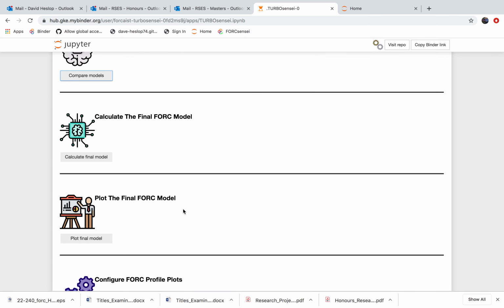There's an interactive interface where you can add a color scale, you can change the range of the plot, you can specify things like contours, how often you want contours, what thickness you want contours, and so on. Now, of course, all of this can be changed according to what people think works best. The one thing I don't have at the moment that I think would be useful is a way to interactively change the color scaling.